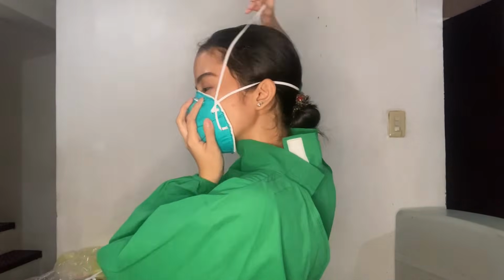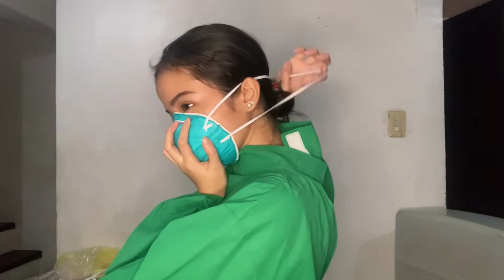For respirators such as N95 masks, select the appropriate size of the respirator. Cup the mask over the mouth, nose, and chin. Flatten the metal piece over the nose bridge. Then secure the upper ties at the back of the head and lower ties at the base of the neck. Make sure that straps are not crisscrossed. Then adjust the respirator to fit your face.